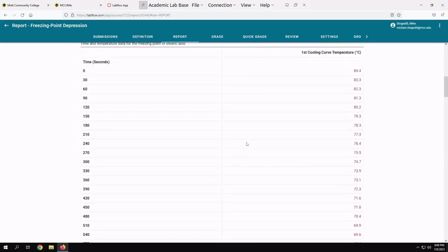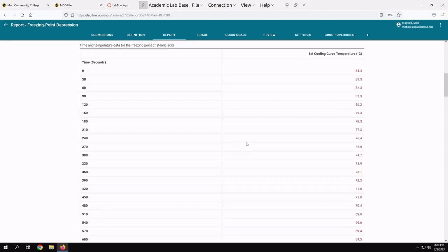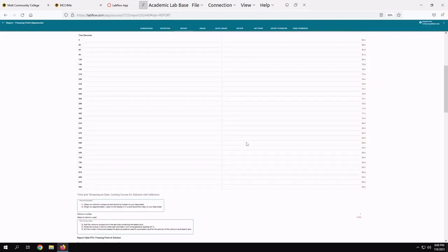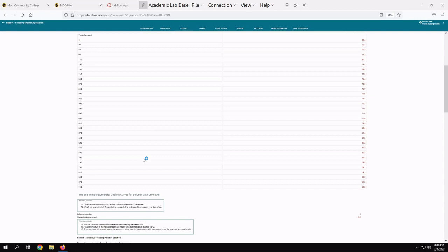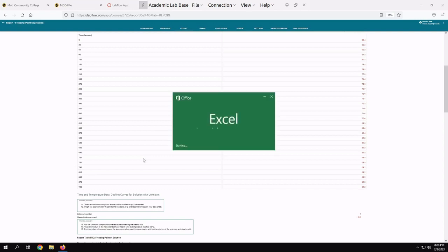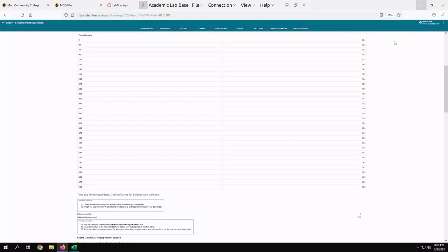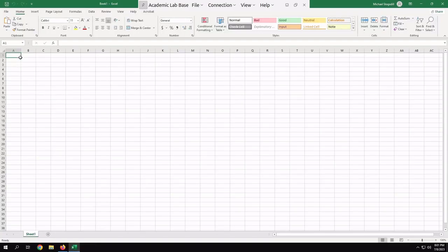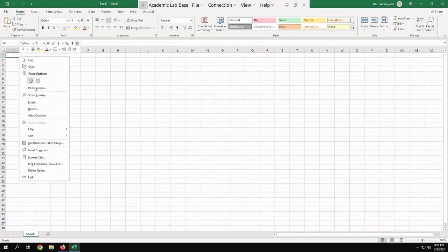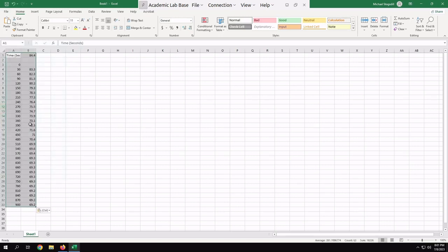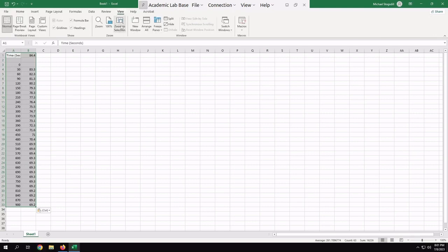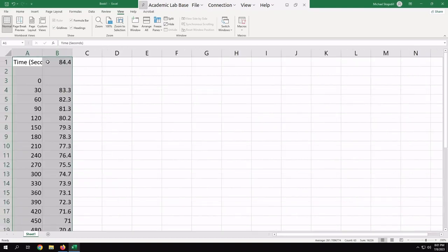The first thing we need to do is get this into Excel. They didn't make that super easy for us. What I like to do is just make this really small so that I can fit it all in there. Come down here to Start, click on Excel, just have that open. We can minimize that for now. We'll come over here. We'll start up here and we'll just highlight that whole thing there. You can Control-C that or you can right-click and hit Copy. Come into Excel here and paste this into Excel. It did an alright job but it doesn't have that perfect. Let me increase the zoom here a little bit so you guys can see it better.